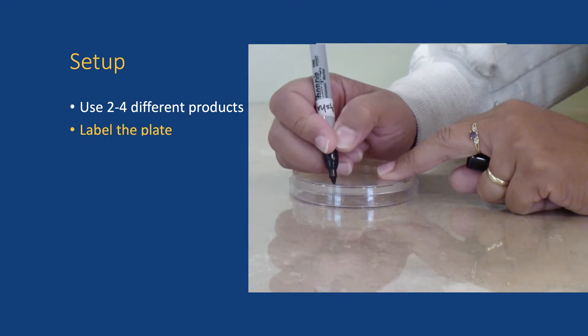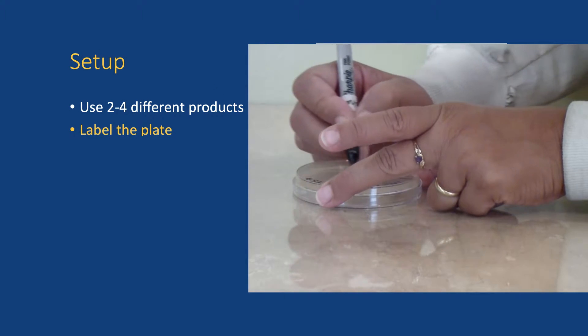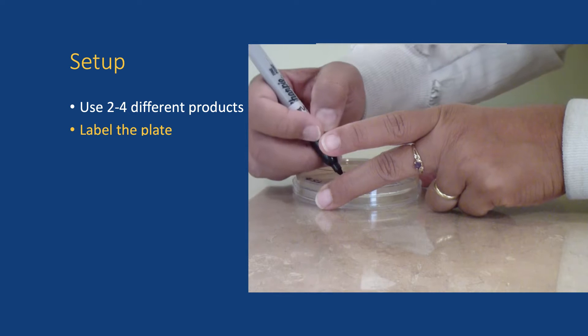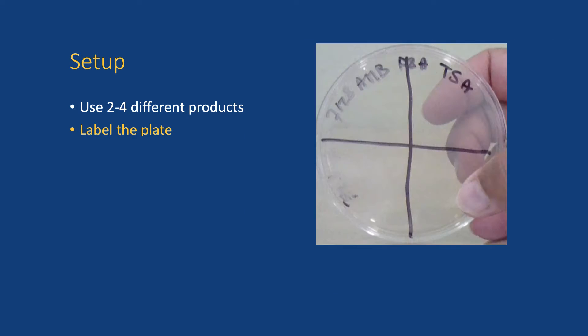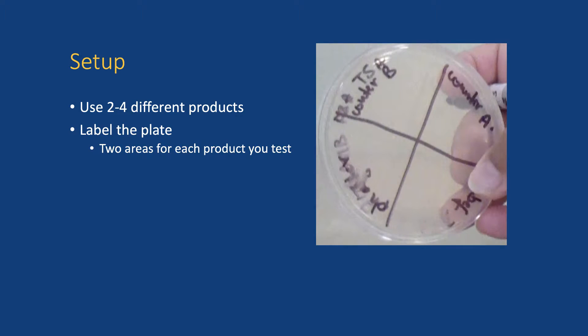Label a TSA plate. With a marker, draw lines to divide the plate into roughly equal segments. You will need two for each chemical. In this example, I will just use two chemicals, so I divide my plate into four equal parts. Label each part and add before and after, so you know which is which.